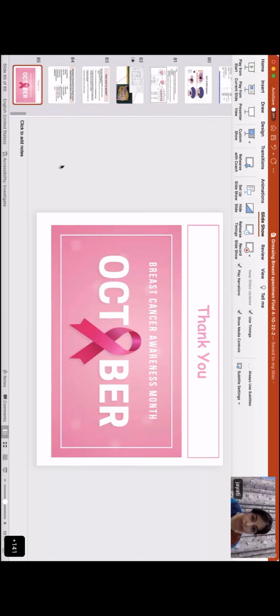Next was, what is the significance of measuring the skin flap in a mastectomy? This is more of a theoretical question, because for the skin flap measurement, basically we will try to, just one second, I'm losing my train of thought. Ma'am, can you please help me here?